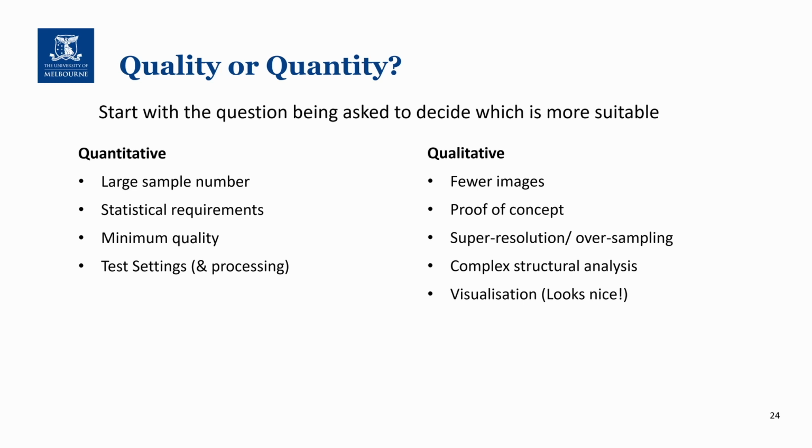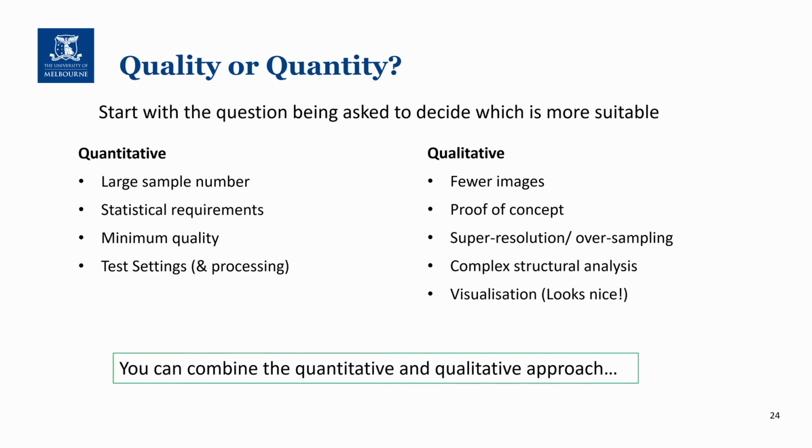Another time when the qualitative approach is appropriate is when you simply want an image that looks really nice. This could be for a paper or presentation, but that visualization can often be key in telling the story behind your project. It's also important to note that you can combine the quantitative and qualitative approach, so you're not tied in to one or the other. It's about finding a balance in your workload and in the research and answering the scientific question.